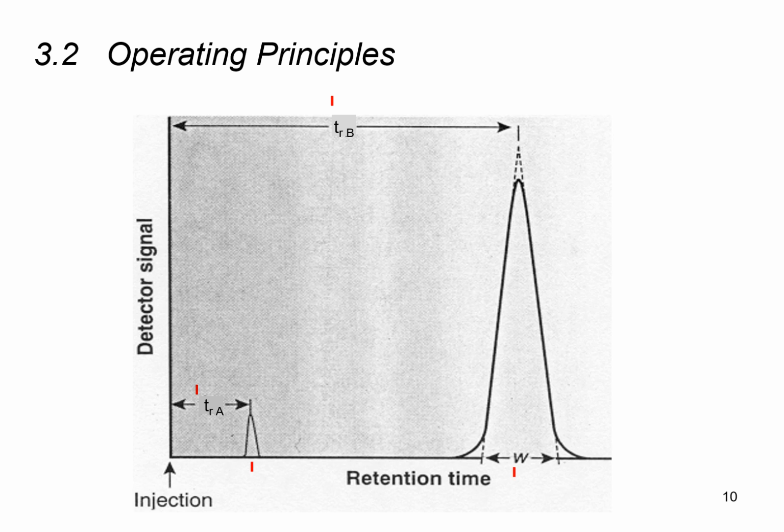We also see from the chromatogram that there's a big difference in the size of the peak. Clearly, peak A is much smaller, which means that there's only a little bit of component A present in the sample mixture. But if we look at peak B, clearly it's quite large. So what that means is that there's quite a lot of component B present in the sample mixture.